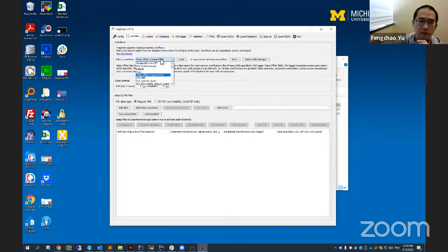There are really a lot of workflows, and I will not go through each of them right now due to time limit. I will use the one we are going to show for the TMT analysis, which is the TMT10 MS3 quantification. After I load it, there are global settings for the memory and the number of threads FragPipe will use. You can leave it as default.